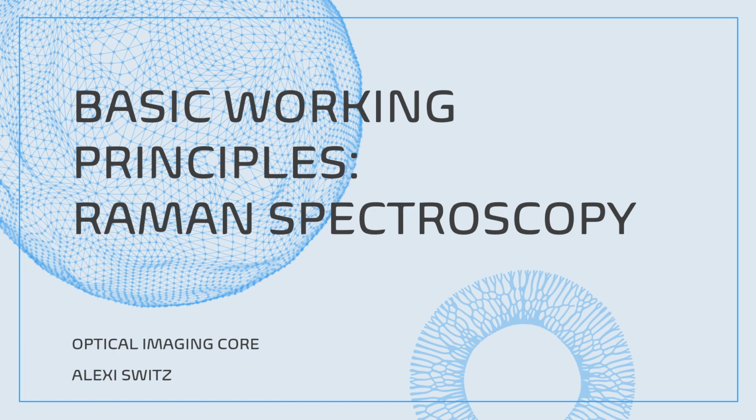Welcome to the first step in the Biomedical Engineering Department's Renishaw-Raman microscope training. We will first begin with this brief video discussing the basic working principles of Raman spectroscopy.